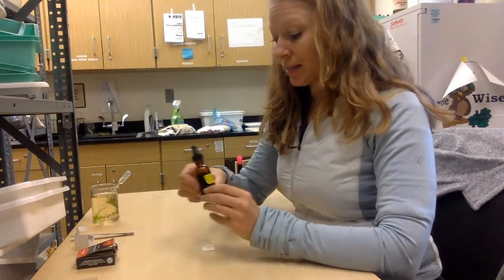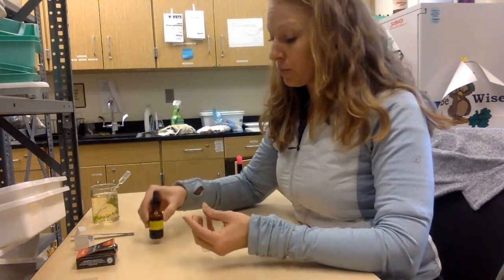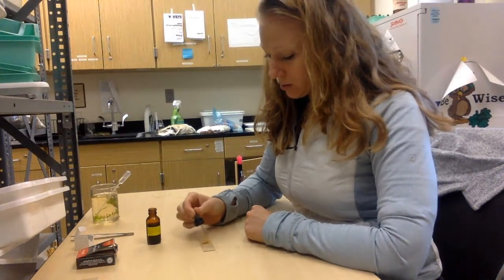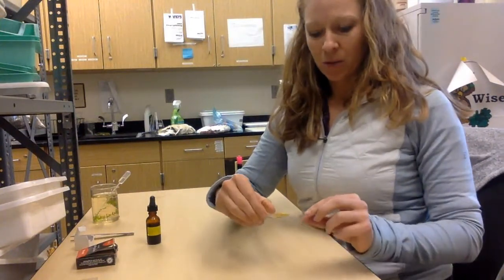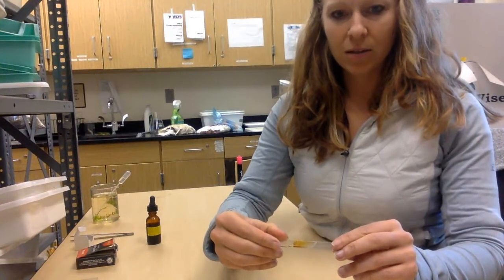So this is iodine solution. We've used this in the past, Lugol solution. And what you do is you put a little bit, maybe like a quarter of a dropper full on one side. And as you can see, you may not be able to see this. It's only going to fill up one side.